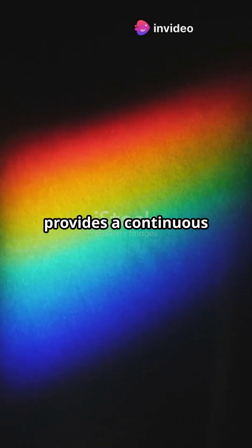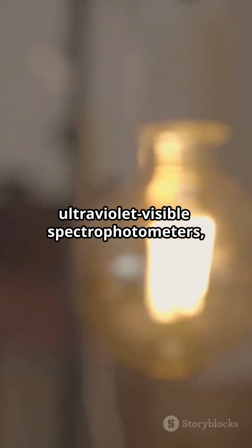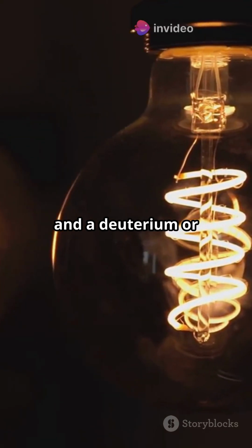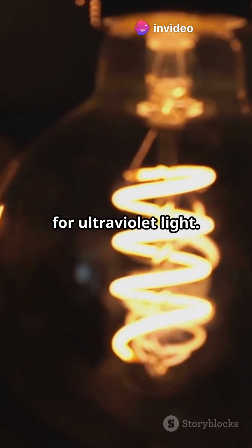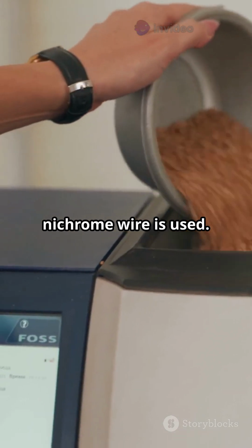The light source provides a continuous spectrum of light. For ultraviolet visible spectrophotometers, a tungsten filament lamp is used for visible light, and a deuterium or xenon lamp is used for ultraviolet light. For infrared spectrophotometers, a heated ceramic or nichrome wire is used.